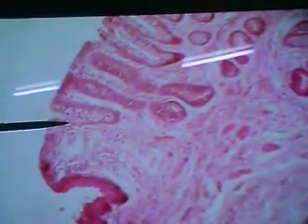So right at that very point, right here, that is the what? The junction between columnar epithelium and stratified squamous epithelium. And this is described histologically as occurring at the pectinate line. So histologically, the histologist would say everything above is rectum, everything below is anal canal.